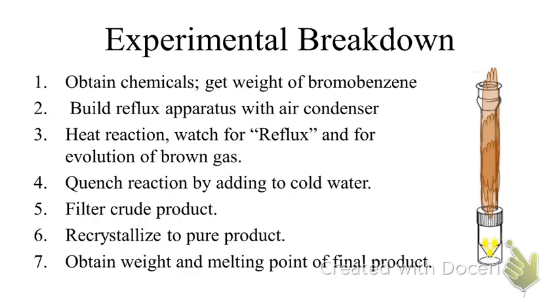Okay, overall experimental breakdown, pass out the activities. You'll obtain the chemicals and mix them together. Be careful with the acids. I cannot stress that enough. You need to be super, super careful. We don't want to deal with any burns. If you do spill it on yourself, you will be spending 15 minutes in the sink. And we will time that. And 15 minutes is a pretty long time, just so you know. Then you can make them sit in the sink with you.